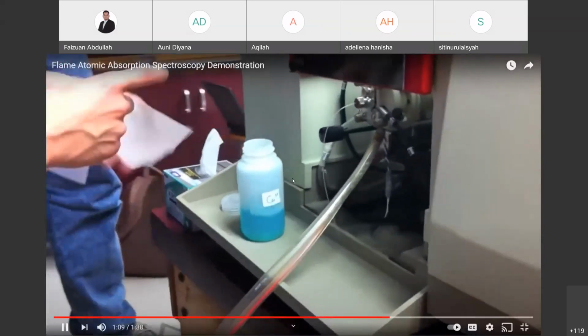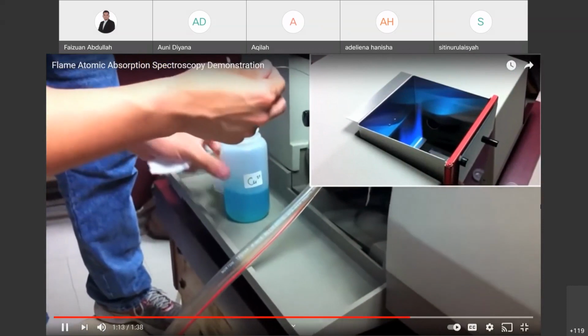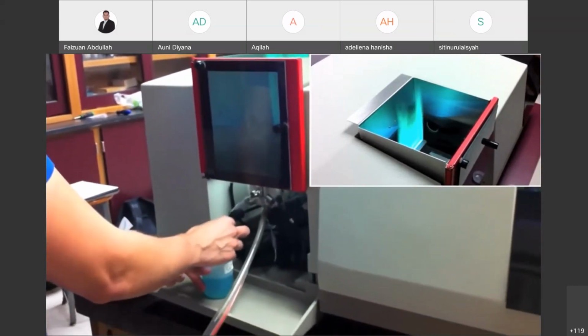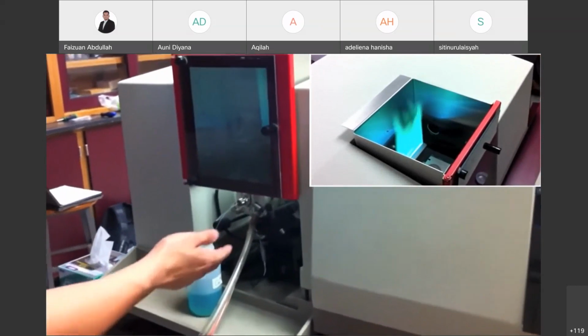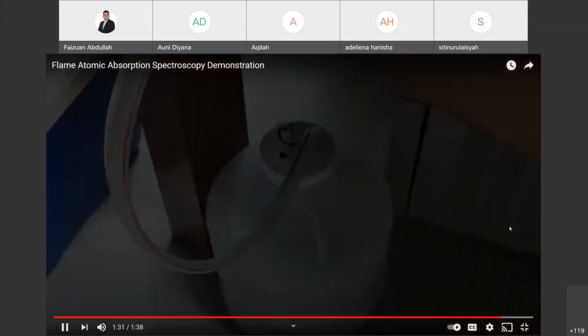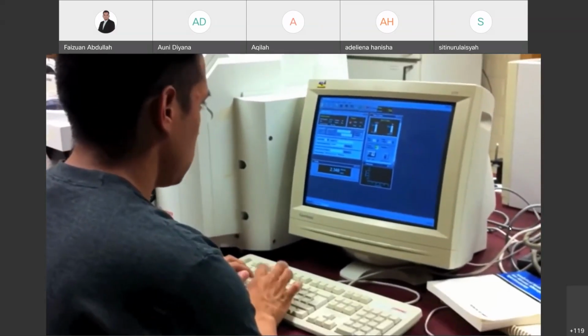First, start by cleaning the sample capillary with a chem wipe. Then, insert it back into the sample to be aerosolized, mixed with gases, and released into the flame. The flame turns a green color that is distinctive of copper. Waste is then siphoned off into a collection bucket. The data is then sent to the computer for analysis.